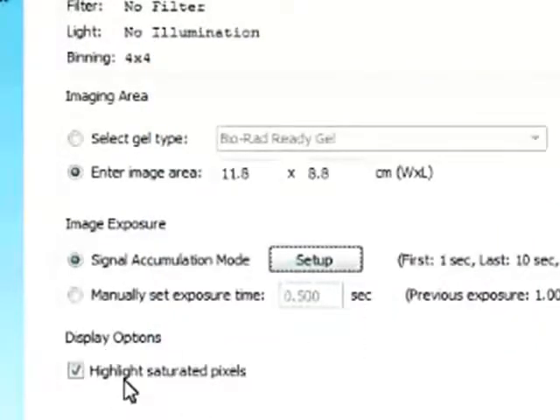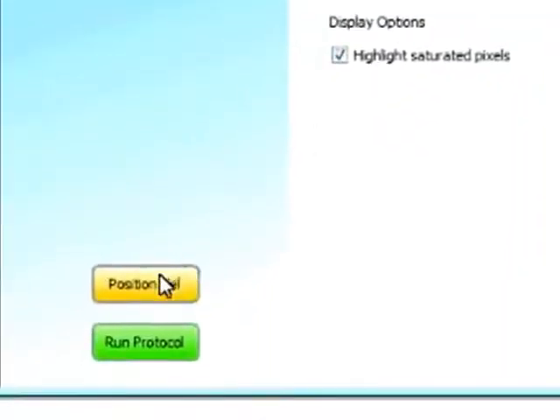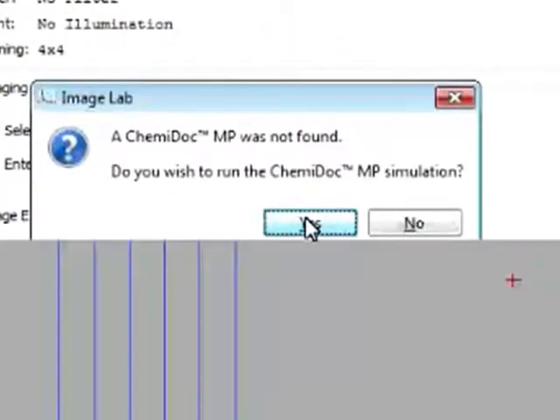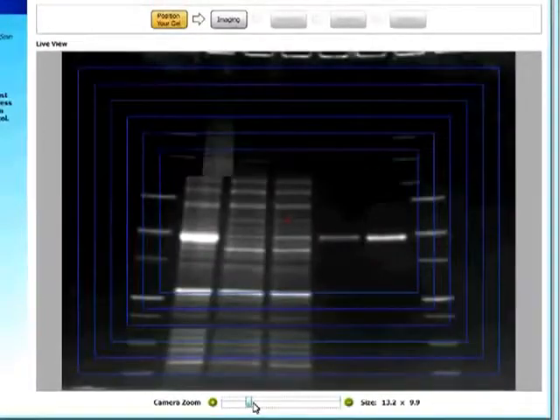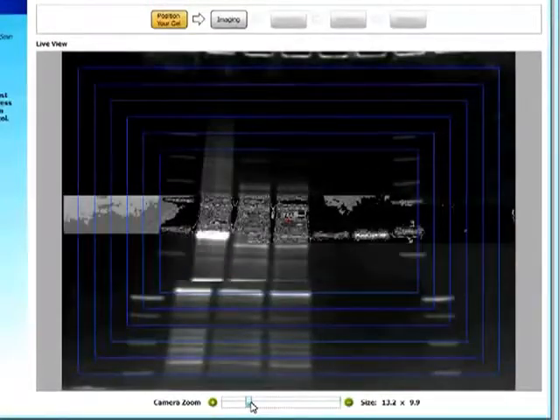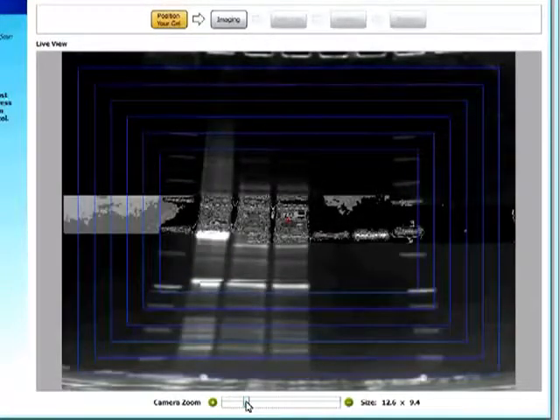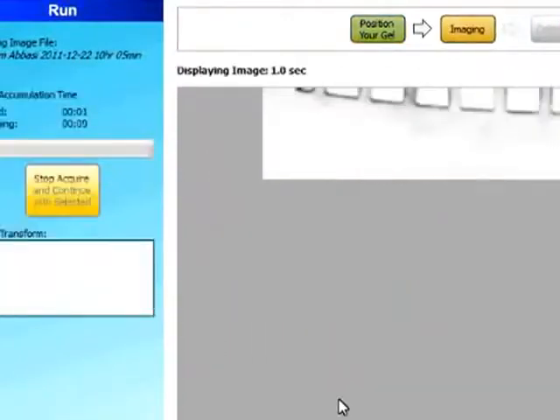And you can also select to highlight saturated pixels. And then when we position gel, we can also select to zoom in or out, obviously, and then run the protocol.